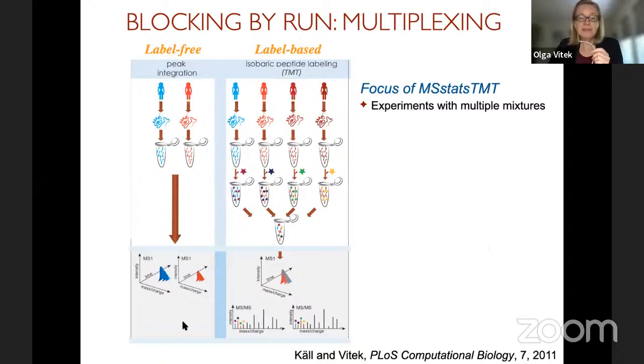And so on one hand, it's easier to do, the samples do not have to be labeled, there's no complex processing. On the other hand, the price is that we take longer, but also the between-run artifacts impact our statistical analysis, impact our ability to detect changes potentially.